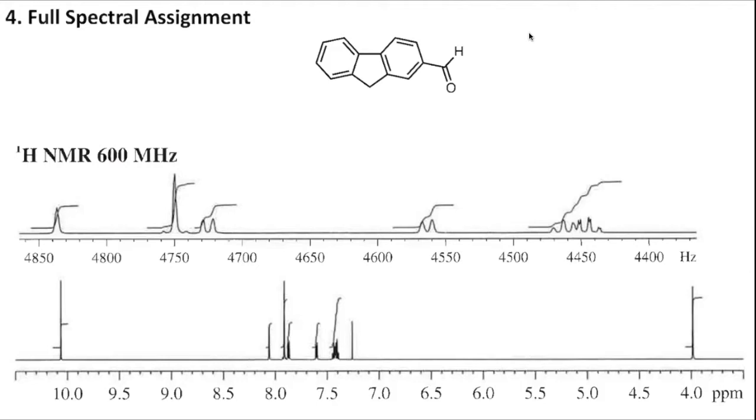You're going to have to do a combination of the two for your post lab. You'll have a choice of two isomers, but whichever one you choose, we're going to ask you to do the full spectral assignment for. So let's dive in by taking a close look first at our one-dimensional data, and then we'll look briefly through the two-dimensional data, finding cross peaks and correlation signals, and tabulating them all up so that we can get a sense for what data we have, and then we can start to put the pieces in place.